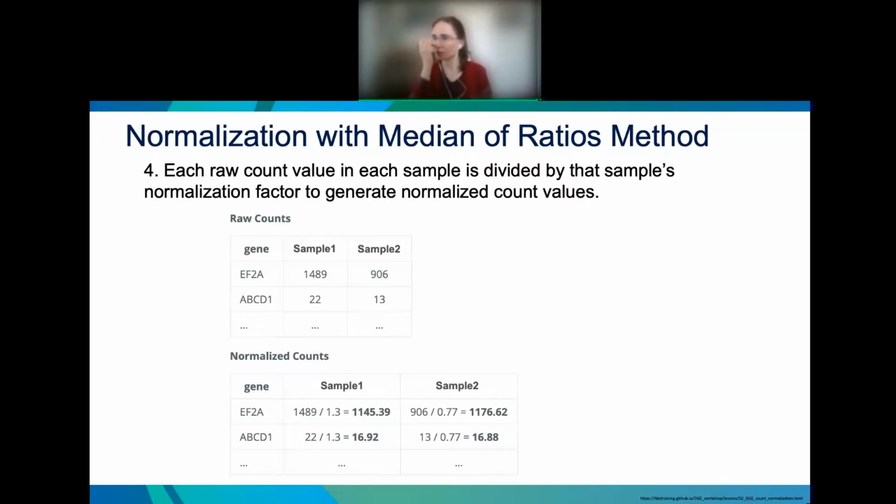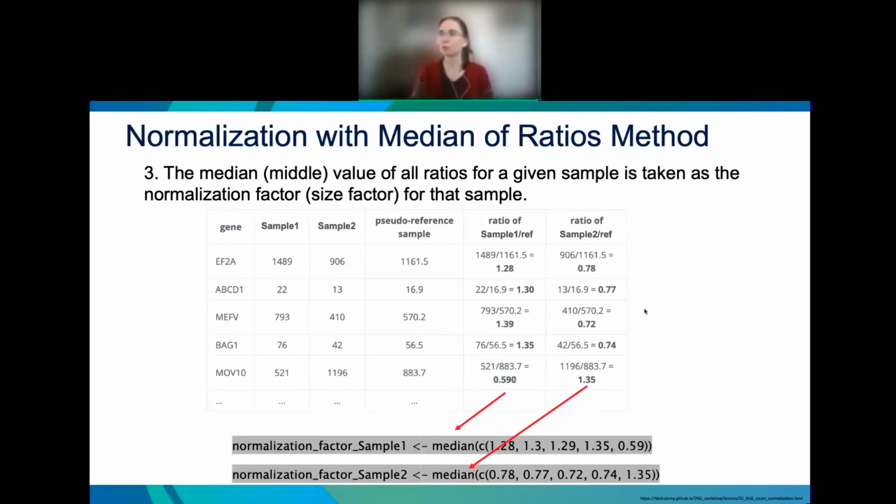How does that scale across more than one sample? Or is this only applied for pairwise comparisons? No, you can do it across lots of samples. Here I'm just showing 2 samples, but you can do this on a data set with hundreds of samples. This is done on a sample by sample basis, so it doesn't matter how many samples you have, it just happens.